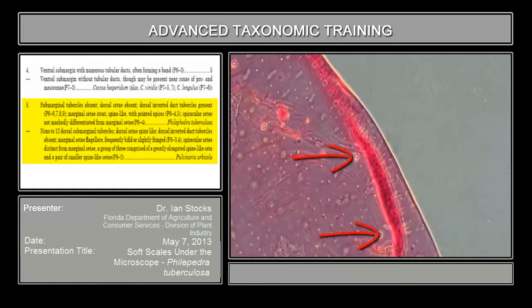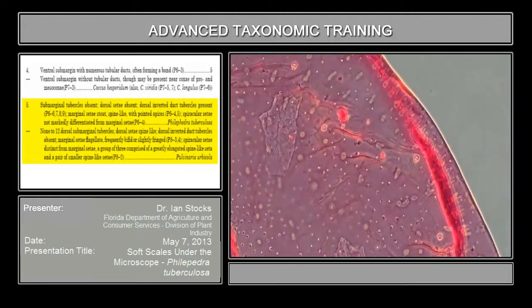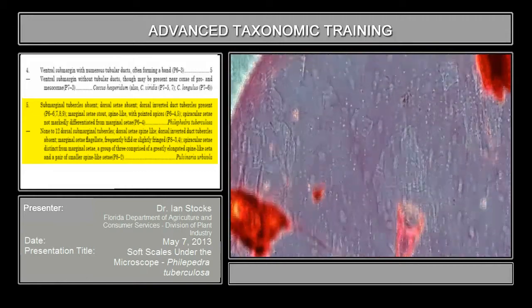Okay. All right. Now they are on the submargin, but you'll see that they are elsewhere on the dorsum also. So there's one there. It's also on the submargin. There's one there. Now, I want you to compare them to the illustrations on plate 6, which are figures 6, 7, 8, and 9. Okay? See if you can find one that looks like it's in a nice clear area and you're going to be able to maybe get a good, more detailed view of.